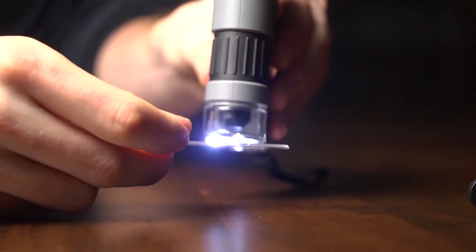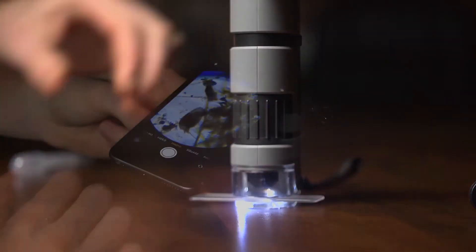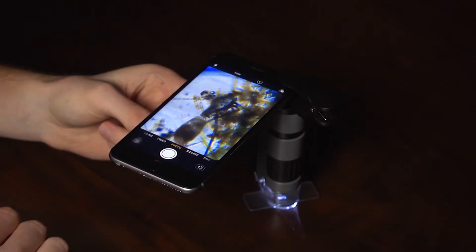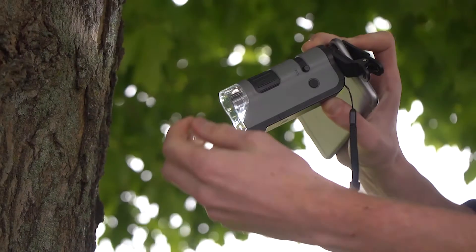Check out how cool something like pond water looks. It's amazing how many things there are that you just can't see with the naked eye. When you're not viewing slides, remember to flip back the base plate.